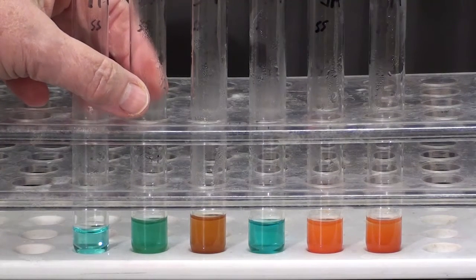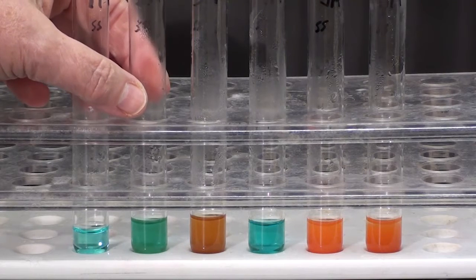If you look carefully, this is not light blue. This is a shade of green.